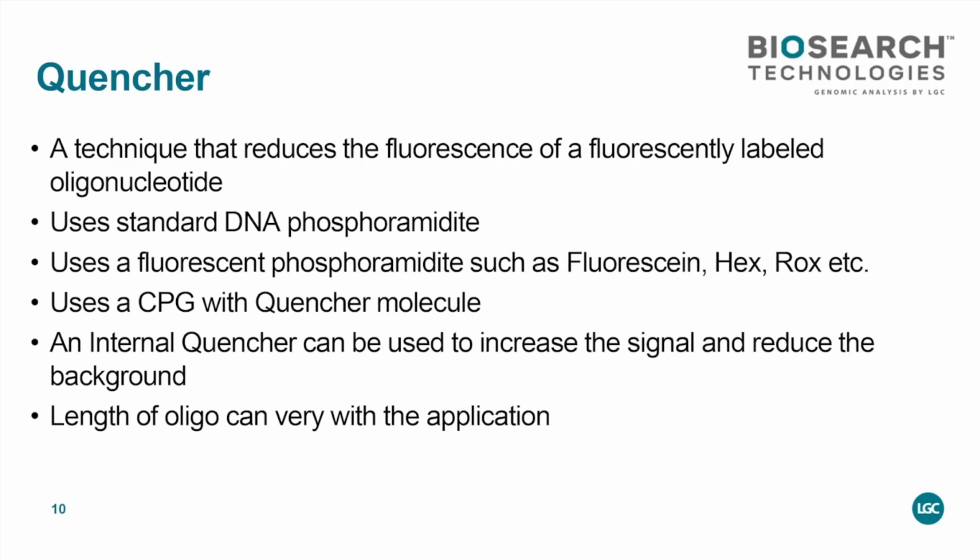So if you have your oligo that folds like that, with the quencher here and the fluorophore here, it doesn't fluoresce because they're close and the quencher covers the fluorescence. When you add it to your assay and it finds a match, for example a positive COVID presence, the oligo actually unfolds and lies flat. Hence, it separates the quencher and the fluorophore, and then you will see the fluorescent reaction.